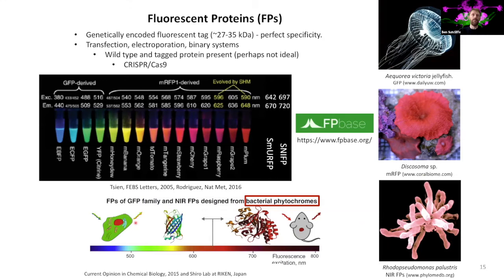The fluorescent proteins have this beta barrel structure which protects the fluorochrome in the middle, which is responsible for the fluorescence. It protects it from large pH changes within the cells, so they're pretty robust for live imaging, although they do bleach more readily than an organic dye.